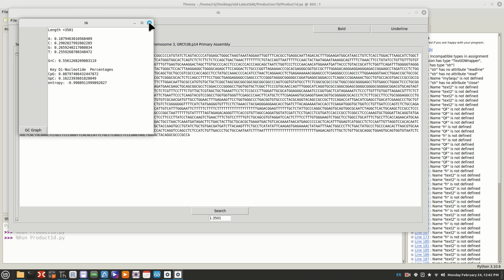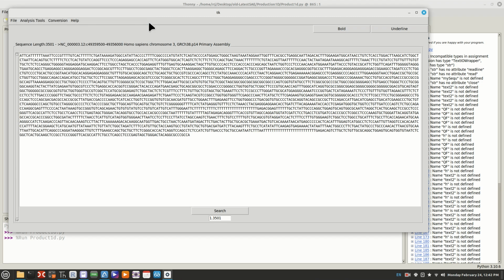That might be because we have a lot of non-coding sequence probably in the 8. We might have taken a lot more sequence outside, or maybe the introns are very large or something in GPX8. We'll investigate that. All right, that's one thing we're going to investigate. So let's get our new sequence here. Here we have this one, and we're looking for 2448. We'll come back to the GC content in a little.